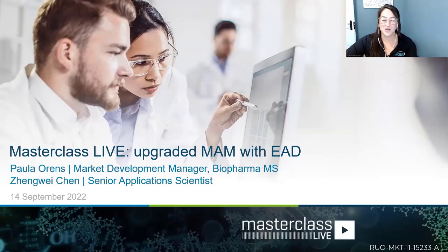So we'll start today's session with a brief overview of the features that we'll be utilizing. Then we'll set up the method, the actual acquisition method, and we'll close it out by processing the data with a focus on my favorite, amino acid isomerization.